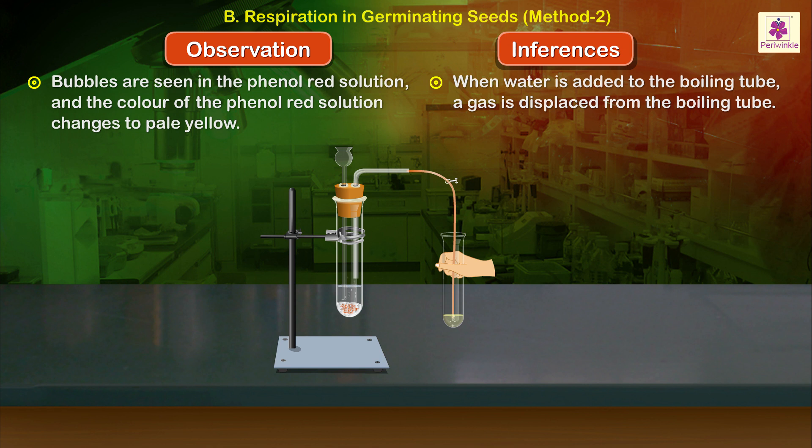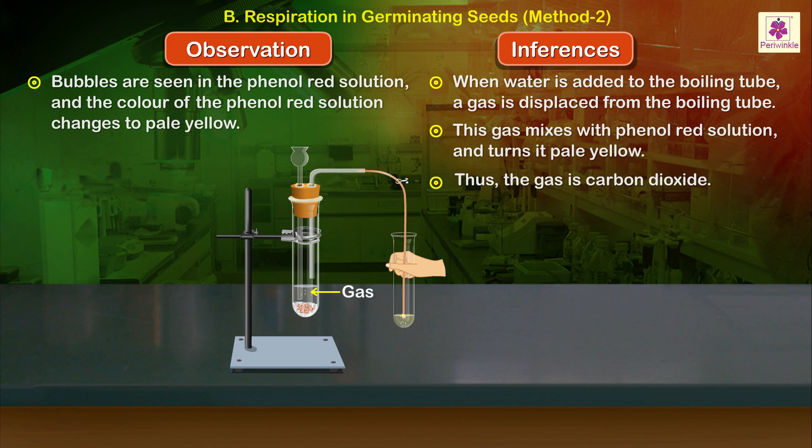When water is added to the boiling tube, a gas is displaced from the boiling tube. This gas mixes with phenol red solution and turns it pale yellow. Thus the gas is carbon dioxide.